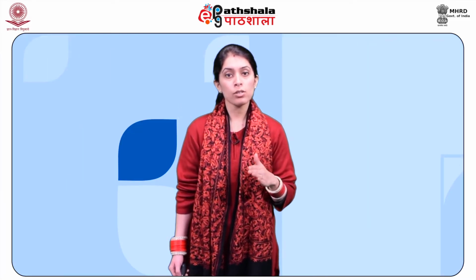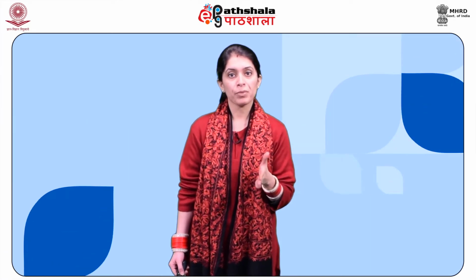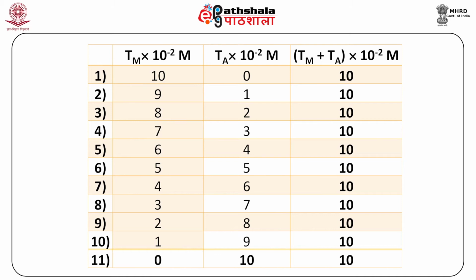Equimolar solutions of metal and ligand are taken and mixed to give a series of solutions having the same total concentration of metal and ligand, but varying the concentration of metal and ligand individually. As you can see on your screen, a table where such a set of solutions is prepared, for which we observe that the total concentration of metal and ligand remains constant. However, we are varying the concentration of metal and ligand individually in the solution.